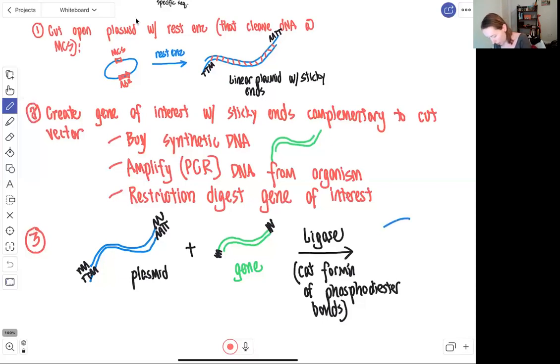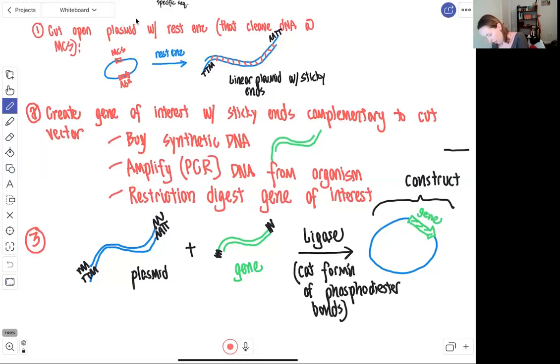So end game, you will have your part in blue that originated from the empty plasmid, or the vector as we could call it. Then we will have our gene in green that we have inserted to give us, as our grand finale here, the construct. And keep in mind that construct would have the elements that we originally had in the plasmid, such as if our plasmid had an antibiotic resistance gene, that's going to get carried through into the final product here as well.